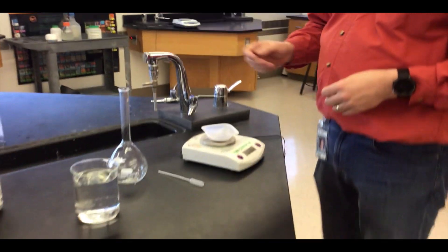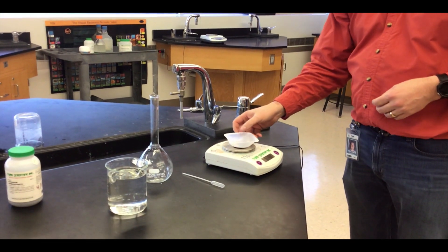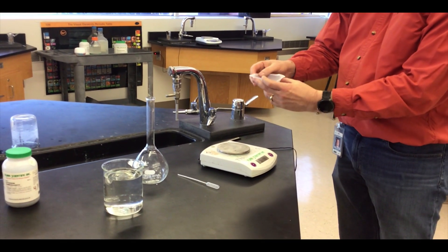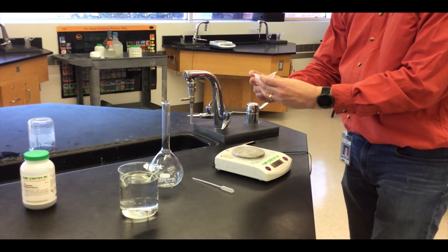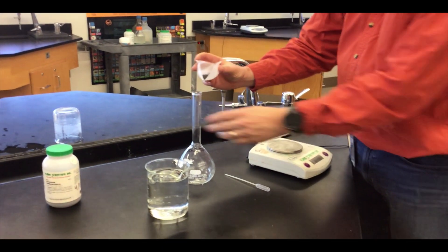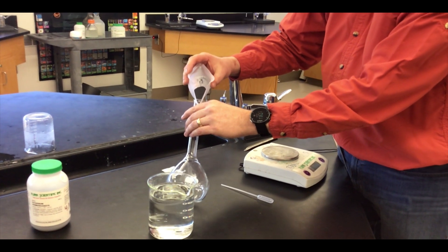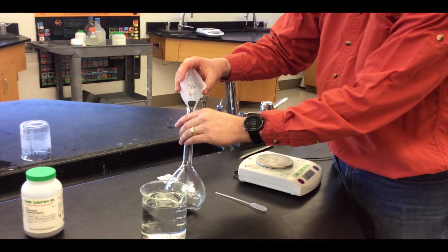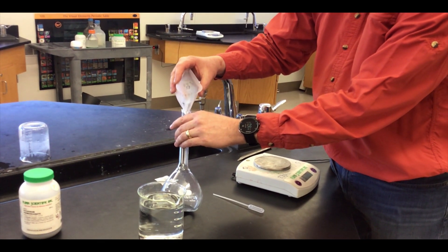So the first thing we want to do once we have our chemical that we're going to make a solution for, our solute, we're going to take that and pour it into the neck of the bottle, of the flask I should say.